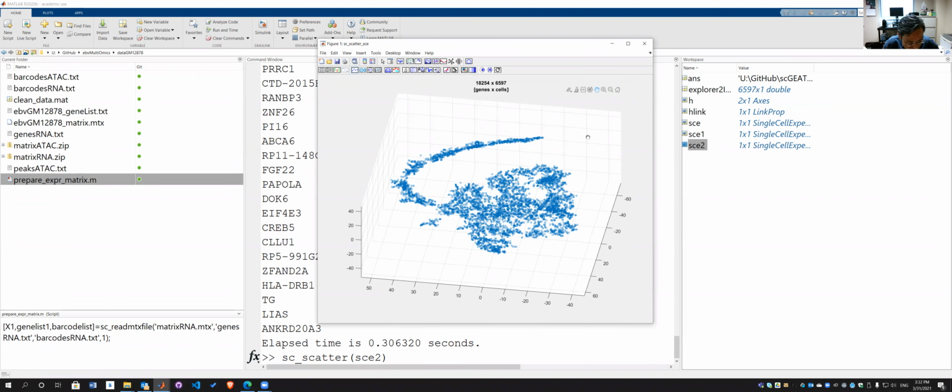Okay, for the rest of the 30 minutes, I will leave it for you, and let me give a quick summary. So I use one example data to show you how to do the clustering after you have this cell embedded. And how are you going to annotate each cluster and give a potential cell type annotation. But before that, I show you how to make adjustment for your automatically clustering algorithm result. You want to reassign some of these cells from one group to another, or you want to make a new cluster, or you want to merge some of the clusters into one.